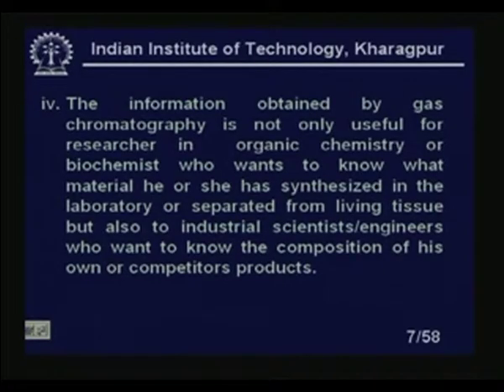The information obtained by gas chromatography is not only useful for researchers in organic chemistry or biochemists who want to know what material he or she has synthesized in the laboratory or separated from living tissue, but also to industrial scientists and engineers. That is the reason we are discussing it in this course on industrial instrumentation.